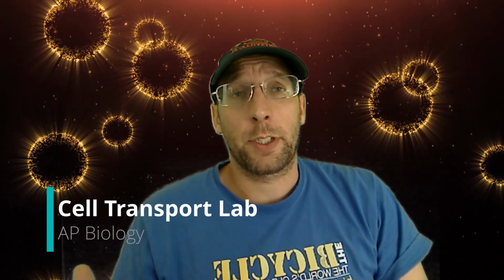Hi everyone. Today we're going to study cell transport through two activities. The first activity, we're going to use a model cell to see what can pass across the semi-permeable membrane. Second activity, we are going to look at the solute concentration of different plant matter.